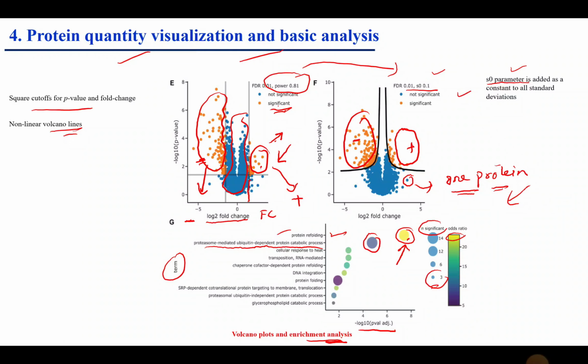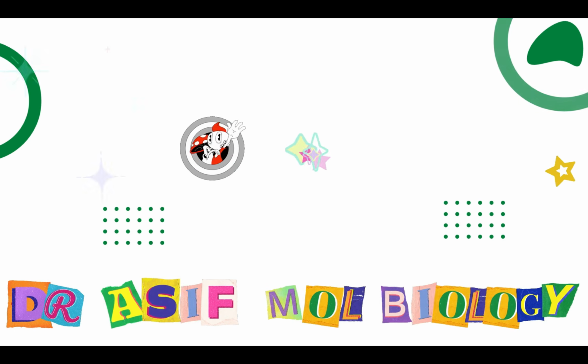So it means that we can use differentially expressed proteins for enrichment analysis to get further insights into which type of proteins are involved in which type of functions.